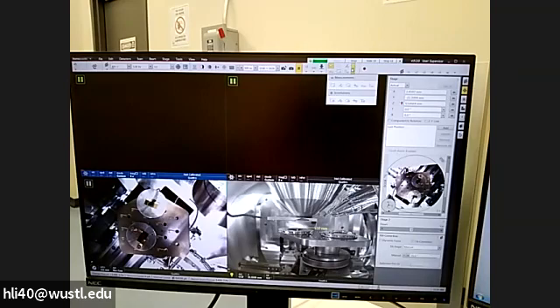Here is a measurement tool. I don't know why it is disabled here. I need to play with it.